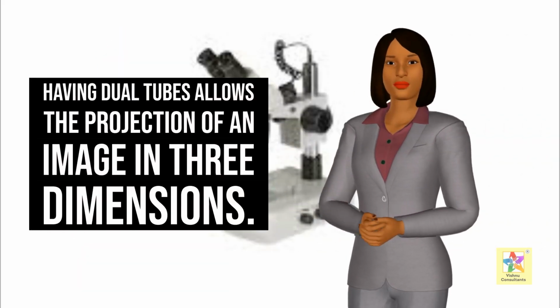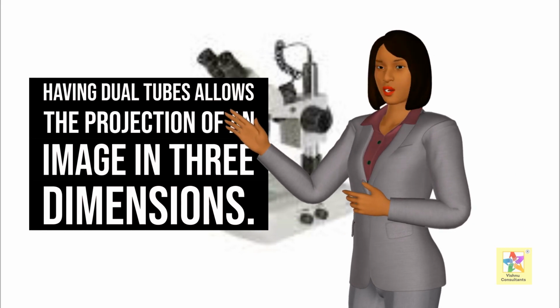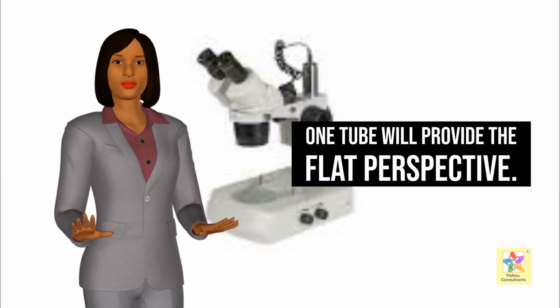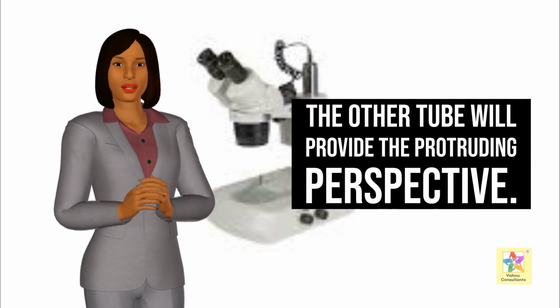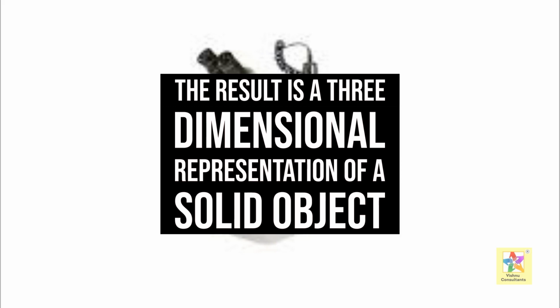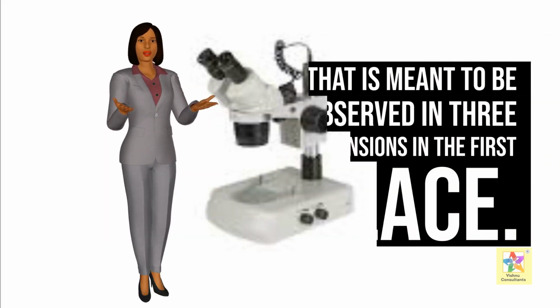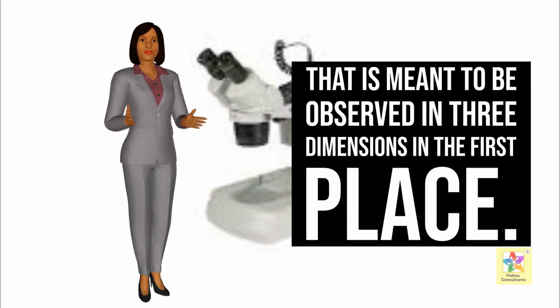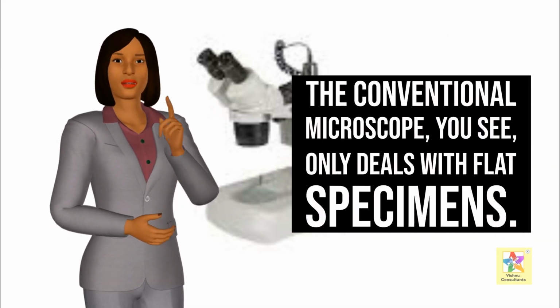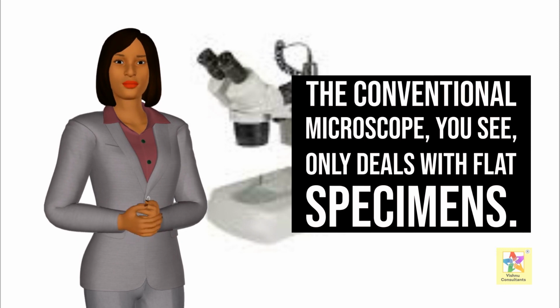Having dual tubes allows the projection of an image in 3 dimensions. One tube will provide the flat perspective. The other tube will provide the protruding perspective. The result is a 3-dimensional representation of a solid object that is meant to be observed in 3 dimensions in the first place. The conventional microscope, you see, only deals with flat specimens.